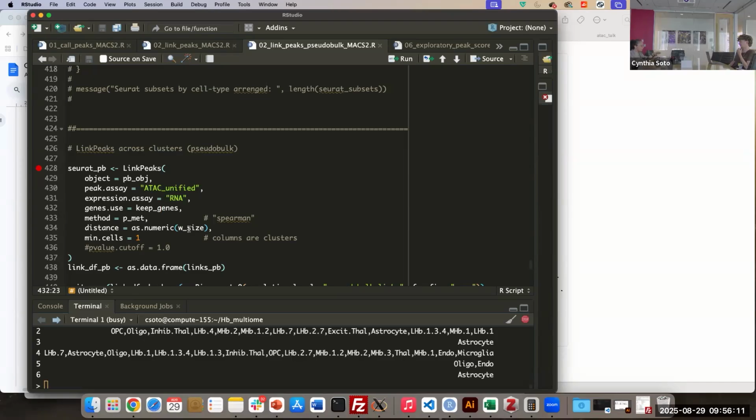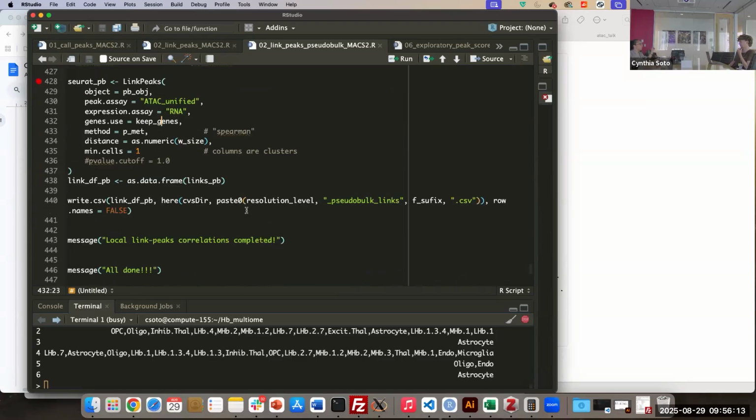So you have here a lot of options to filter genes. And that's it. You have at least peaks. Here I omit the step to evaluate the peaks. But in theory, you need to make the evaluation to see if these relations, let's say, have the statistical power to follow the analysis. And that's it. Thank you.